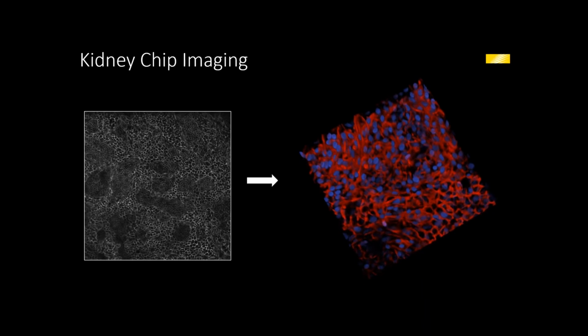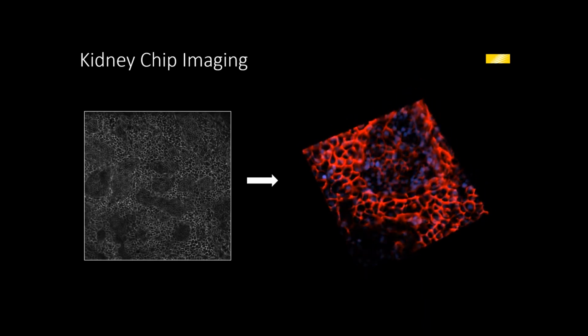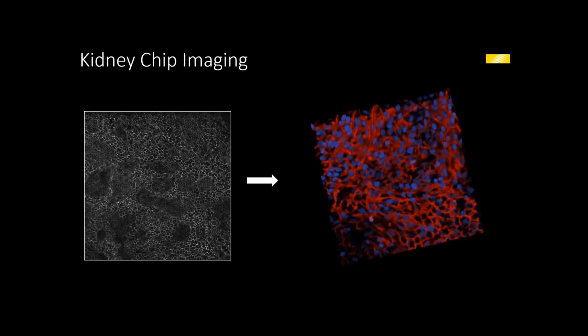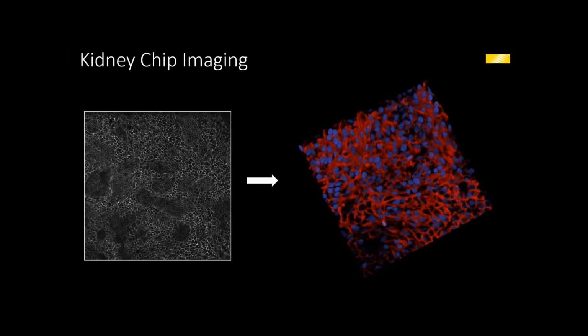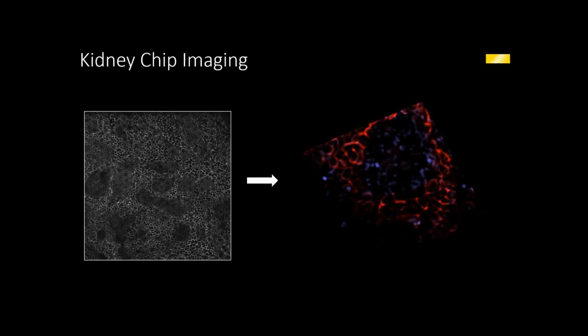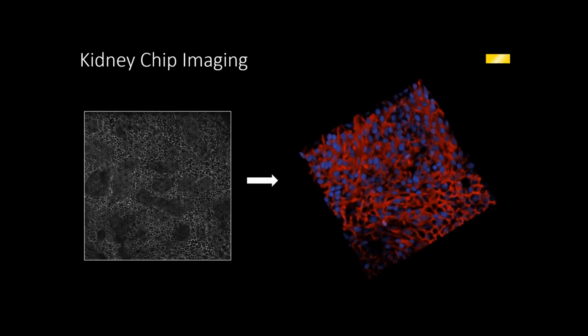And these are some examples of how we can use modern imaging techniques, hardware and software, to screen in modern screening models. So let's switch gears for the next few minutes and just talk about how this is now being applied in the area of therapeutics research and development.